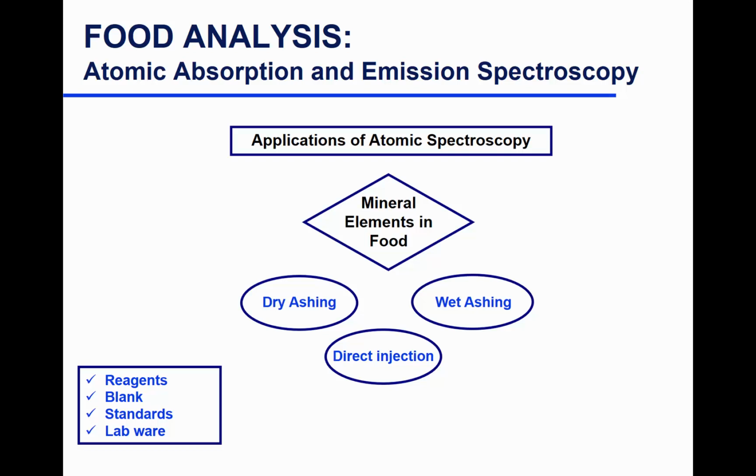Standards, we run standards. Usually we get really very high purity standards, over 98% purity. And these standards are needed to construct a standard curve. You prepare your standard at different concentrations to ensure a linear standard curve, and then you dilute the sample to fall within your linear standard curve.